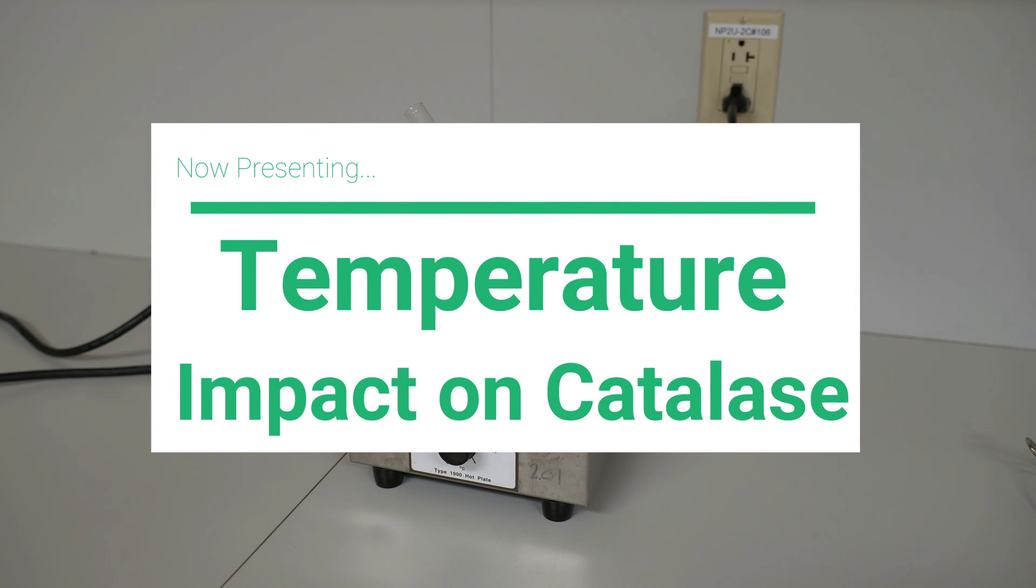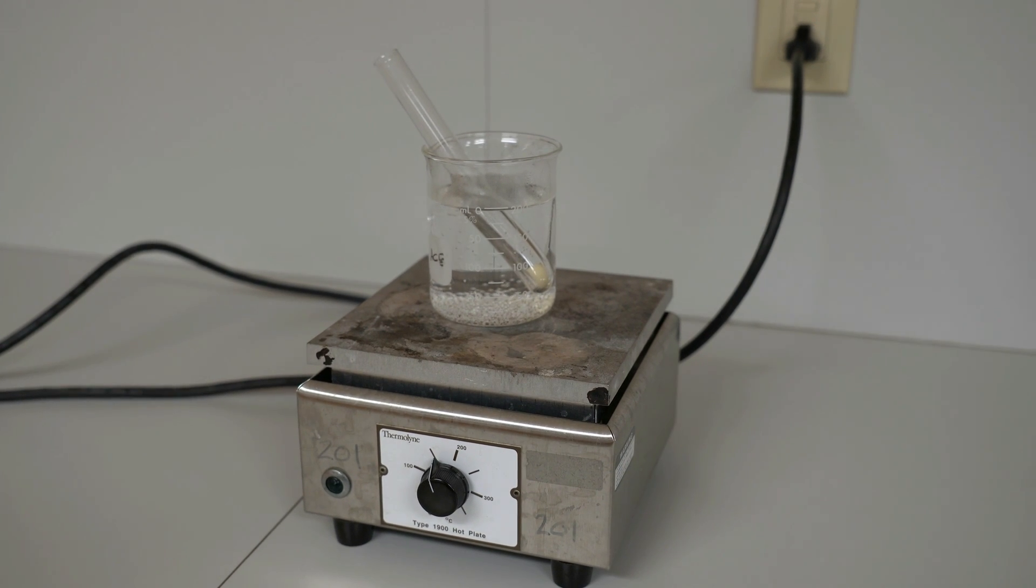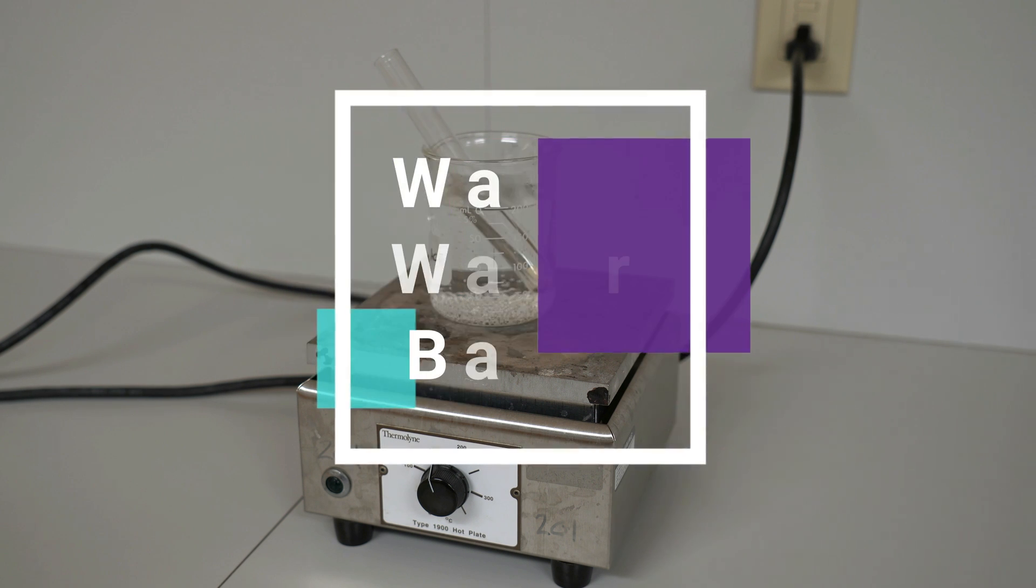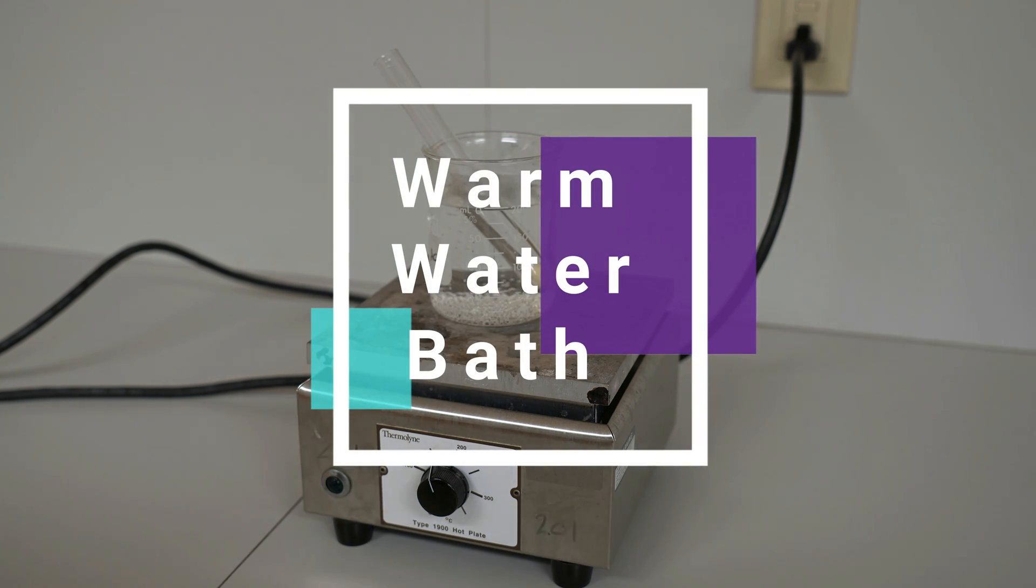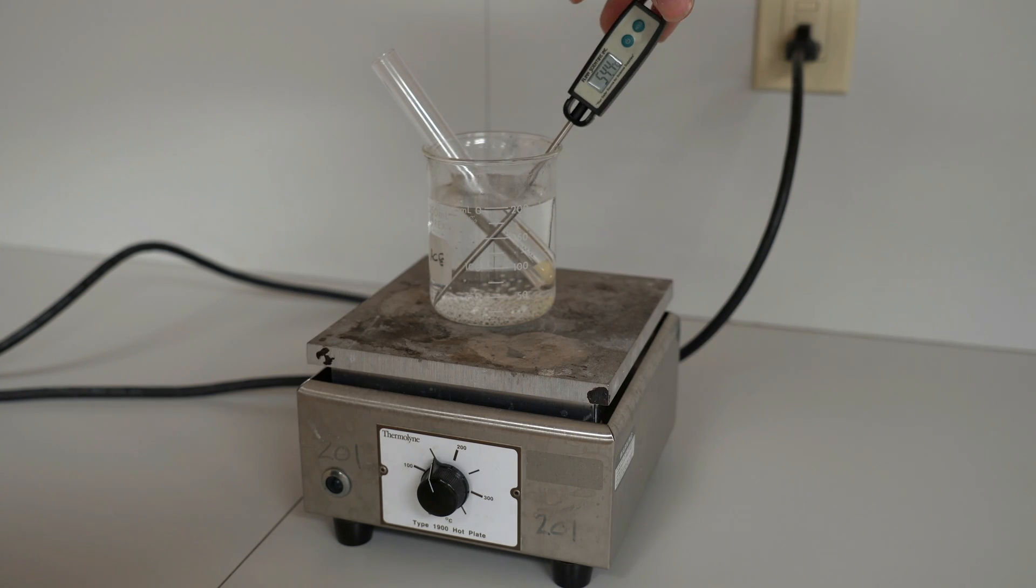So now I'm going to look at how temperature will affect this catalase enzyme. Here we have a piece of potato. I've tried to keep all the potato pieces consistent. We have this in a warm water bath. When I say warm water, what does that actually mean? Well, let's take the temperature of our warm water bath.